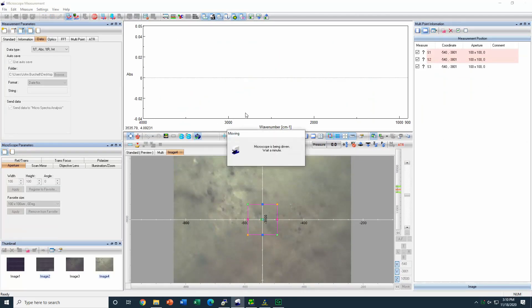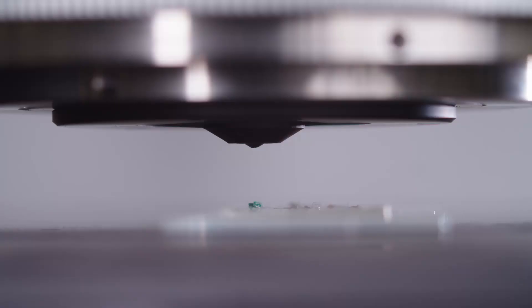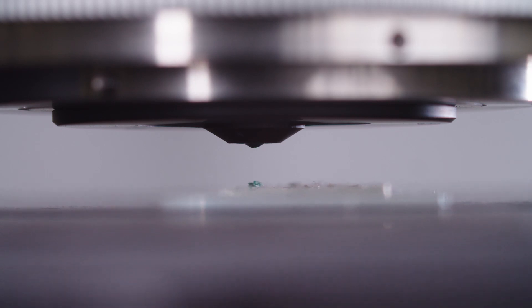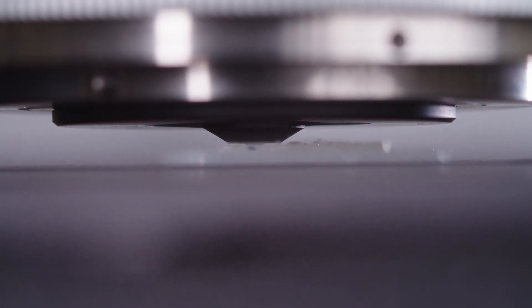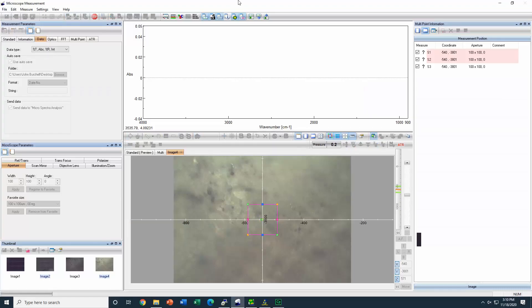This is our ATR micro objective lens and this is an Akasa grain that we can see through it. It is called the clear view and we can see the sample when it's in contact with the ATR crystal.